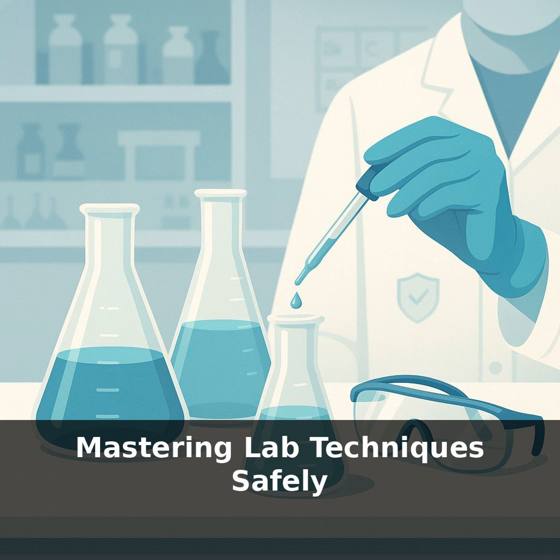Your challenge this week: before your next lab, actually walk the room. Find the eye wash, shower, and fire tools. Confirm what you're expected to wear, head to toe. Then, on purpose, spot one hazard you'd overlooked, maybe a blocked exit or a crowded bench, and decide how you'll handle it next time.